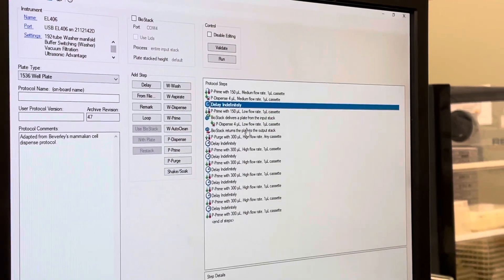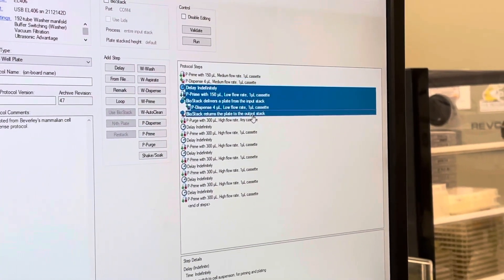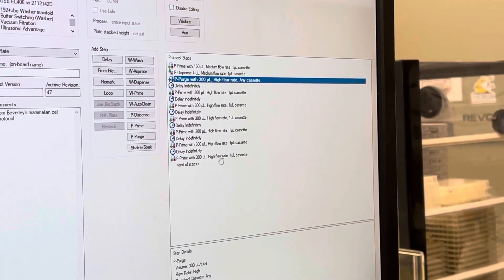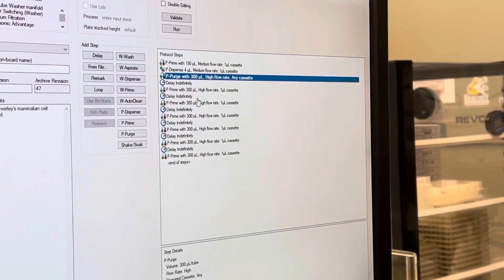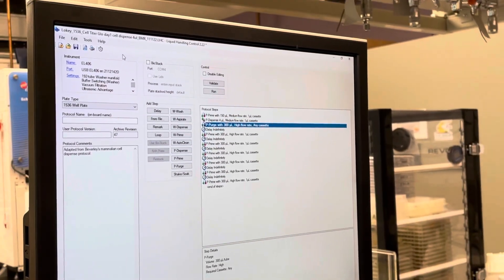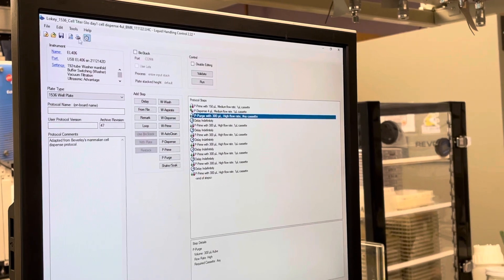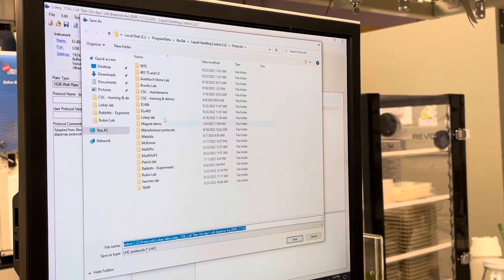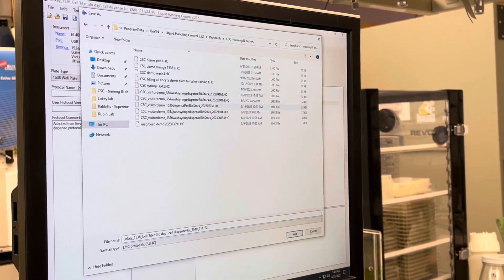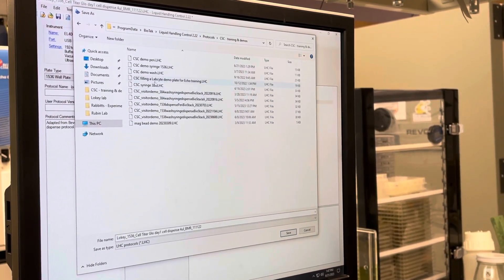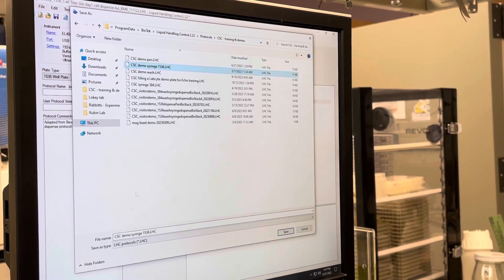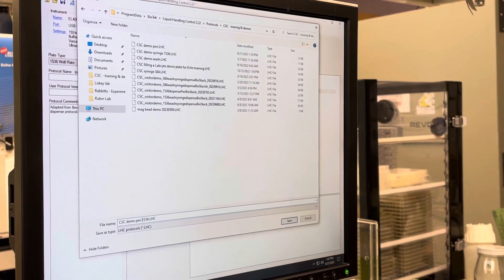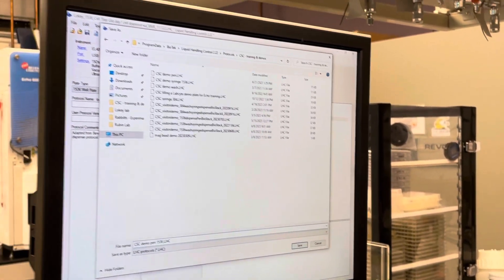This protocol will then go into a purge followed by some primes for washing the cassette. So I just made modifications to this person's CellTiter-Glo assay protocol. Before moving forward, I'm going to go Save As and give it a new name. I'm going to make it a CSC demo — CSC demo peri 1536 — and I'll just put the date.